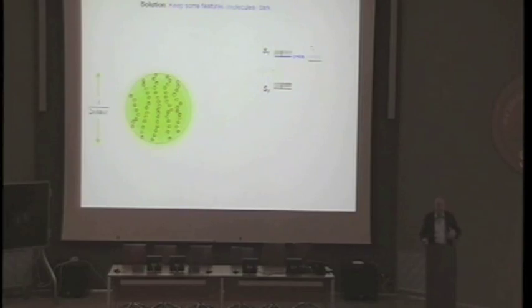While we can't change the fact that all of the molecules are flooded at the same time with illumination light or with excitation light, we may be able to change the fact that all the molecules that are flooded with that light at the same time are in the end capable of sending light back. Because if you manage to change that status of the molecule, able to send light back or not able to send light back, we may be able to separate those that can send the light back from those that can't send the light back.